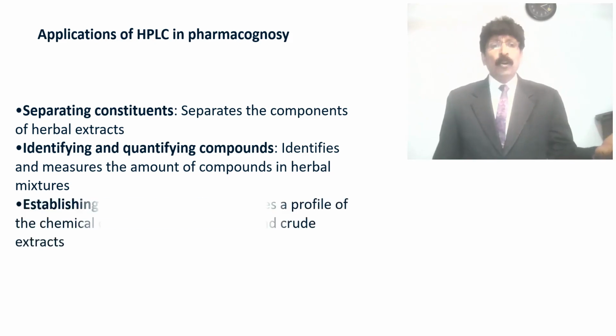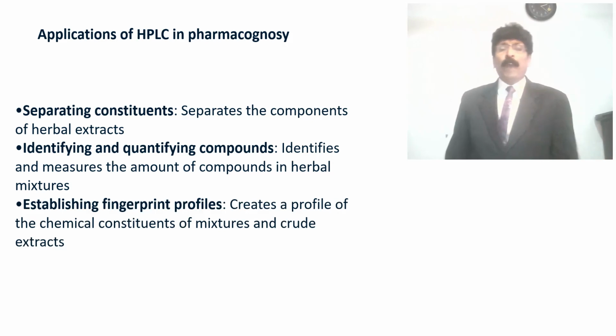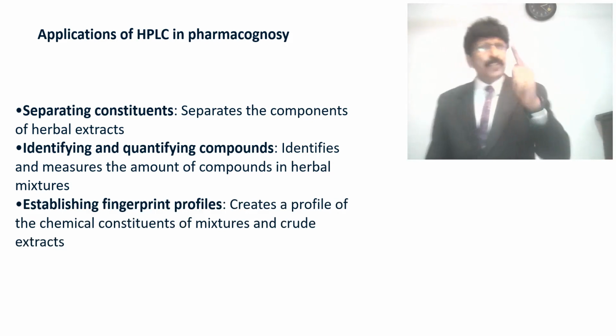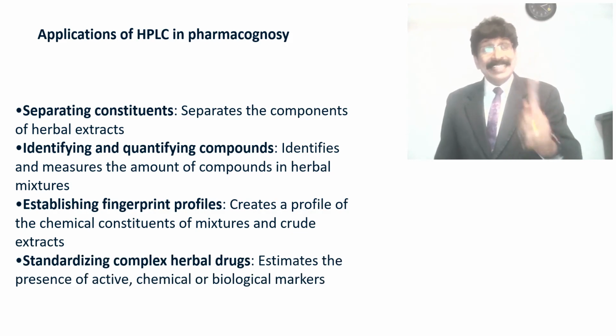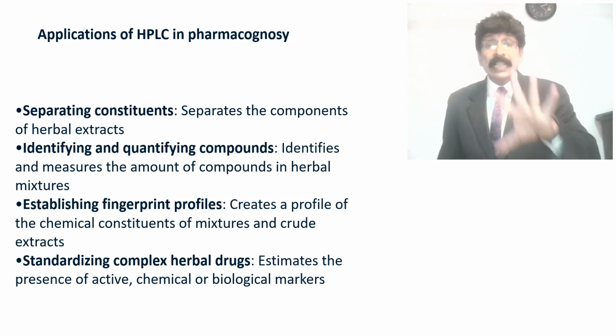You can go for study. Establishing fingerprint profile: creates a profile of chemical constituents of a medicinal plant, mixtures and crude extracts. Standardizing complex herbal drugs.